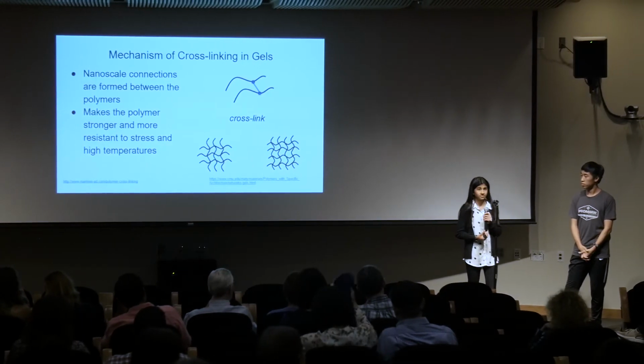Any known findings? Well, we had a short period of time, so we synthesized the gels, and by the time the gels formed, we weren't left with much time. So our main concentration in this lab was focusing on how we could get the gels to form, and then testing their elasticity. Unfortunately, we didn't get a chance to try the degradation, but also these gels are pretty hardy, so it would probably take a lot of force. But that would definitely be a good future test.